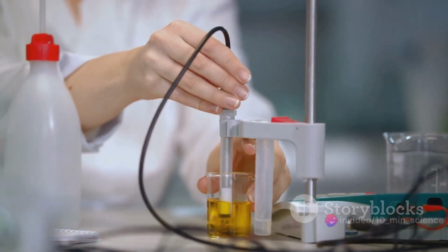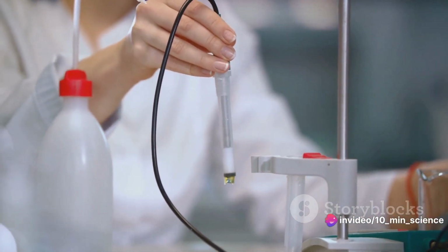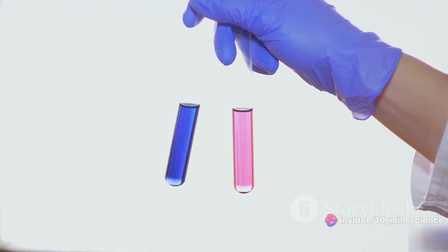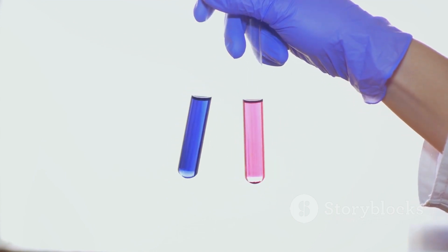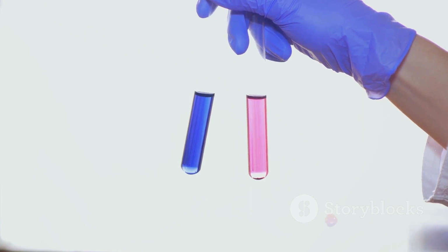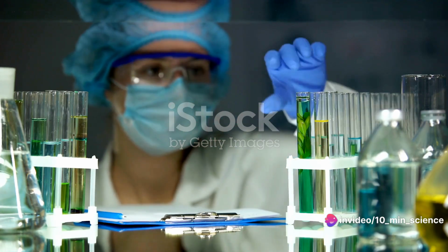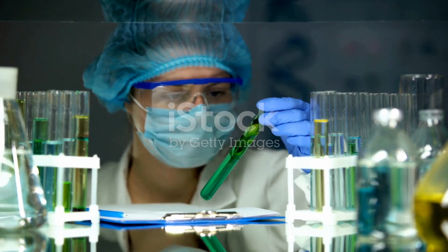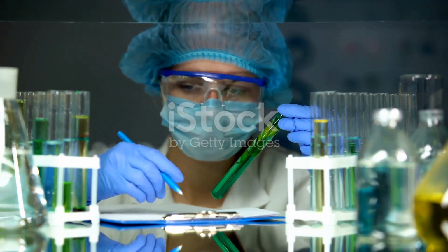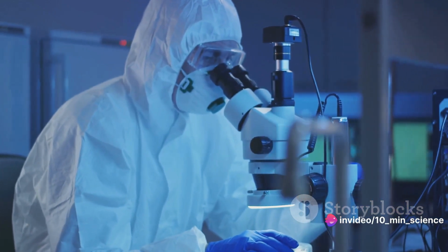After we've completed the testing phases, we have a wealth of data at our disposal. It's now time to make sense of it all. Remember, the aim of the USP chapter <311> Alginates Assay is to determine the content and purity of alginates in a sample. The interpretation of results is a crucial part of the assay. We start by comparing the absorbance of our sample solution with that of a standard solution. This comparison helps us understand if the sample contains the expected amount of alginates or not.